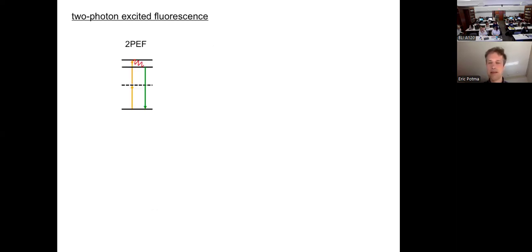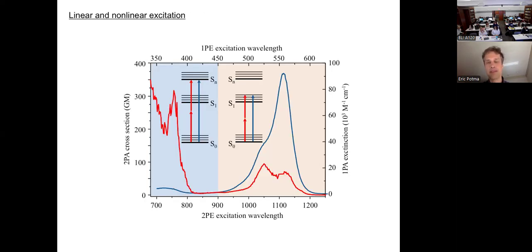So Eric, does that mean, sorry, to interrupt, does that mean that if you actually do multi-photon at a wavelength equivalent to the 1 photon primary peak, you have... because I just see that red is continuing to increase at 700. If you go towards 550, you get just a huge 2-photon peak because basically the first photon already populates this first singlet state. Yeah. I mean, I would say this is more like a resonance enhancement effect.